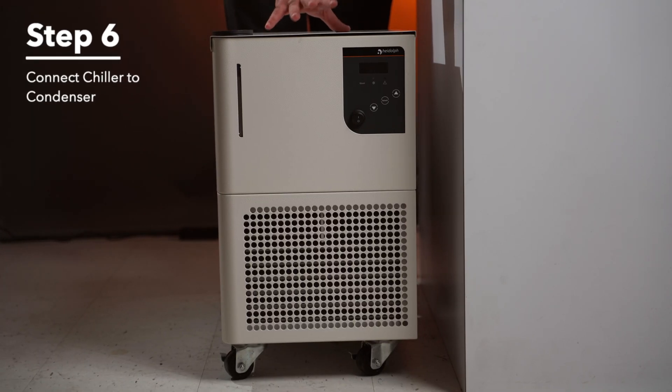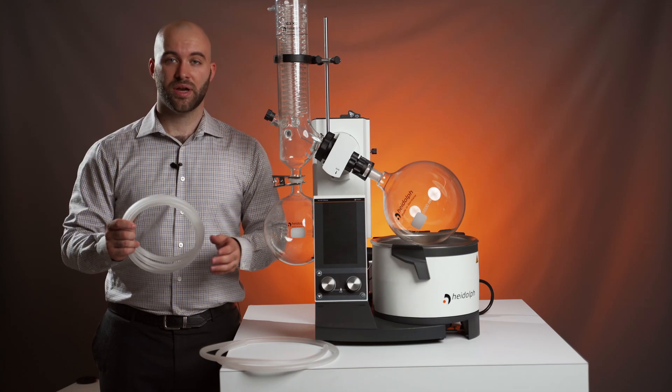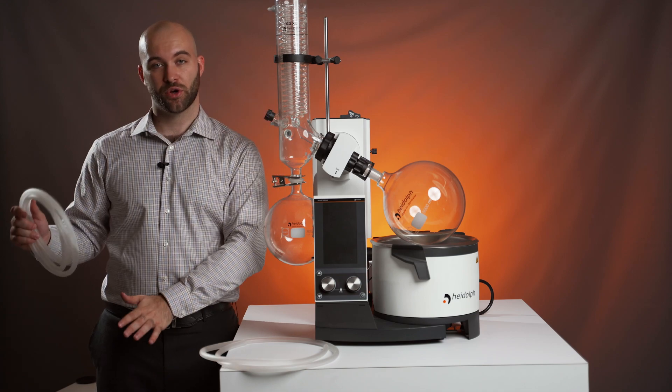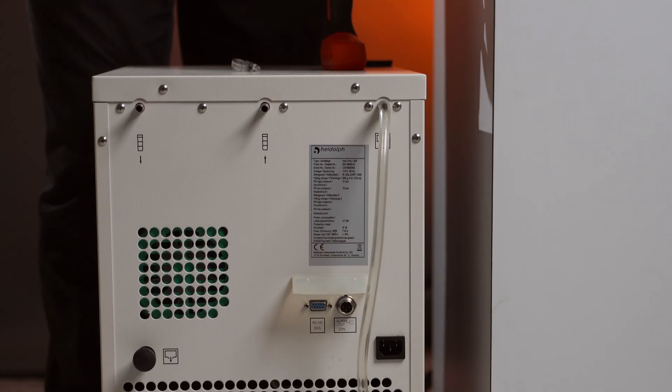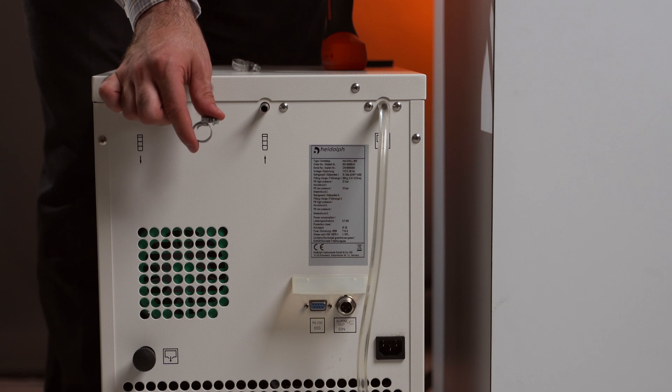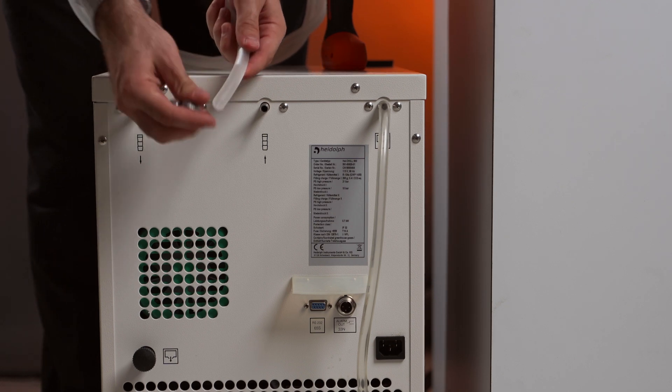Step six, we're going to attach our chiller to our condenser. The first thing we're going to do is cut two pieces of tubing that are the length from your condenser to where you'll be housing your chiller. When attaching the tubing to your chiller, it's important that you use these ring clamps that come in the tubing set, provided with your HiVap glassware.